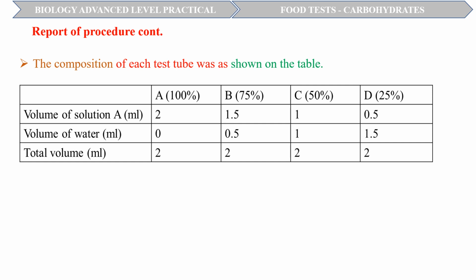Let us continue with the report of the procedure. The composition of each test tube is shown on the table. Here you then draw the table to show the composition. You may need to continue reporting the procedure.